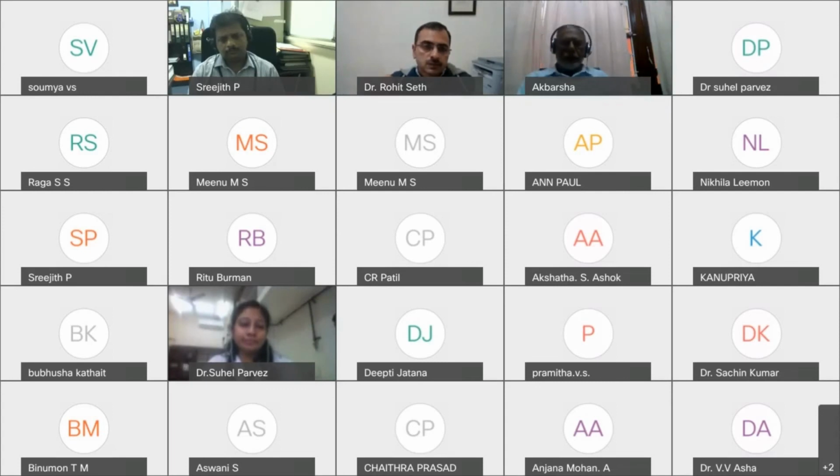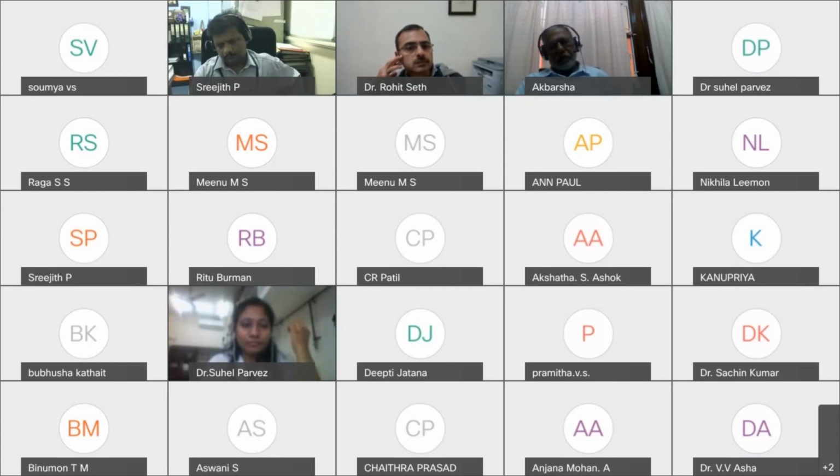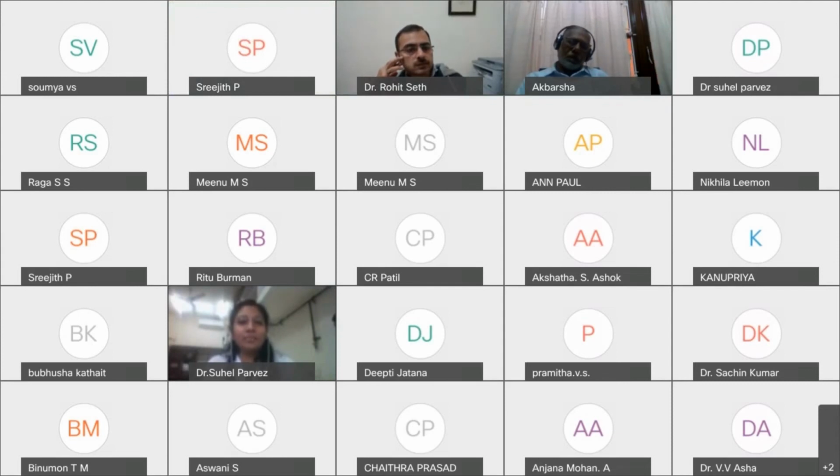What are the alternatives for lean protein other than albumin we can use? Because albumin won't last for more than 12 or 17 hours. It starts getting very bad smell. Is there any other alternative we can use for lean protein? I don't know of any other protein, but I can search for you. 24 hours, I don't think it will get something. When we use the toxicant, we only use 24 hours treatment. So it depends how many times you expose the fly to the media.